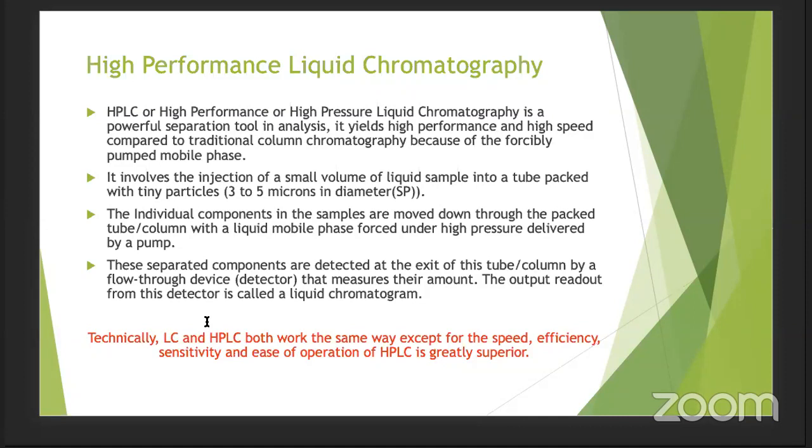HPLC basically purifies or separates on the basis of polarity of the components, where polarity is basically the tendency of a molecule to like or dislike water, like hydrophilic or hydrophobic, as you must know. If a molecule is polar, then it likes water and it's hydrophilic in nature, while if that molecule is hydrophobic or non-polar, then it is not water loving, it's water hating.